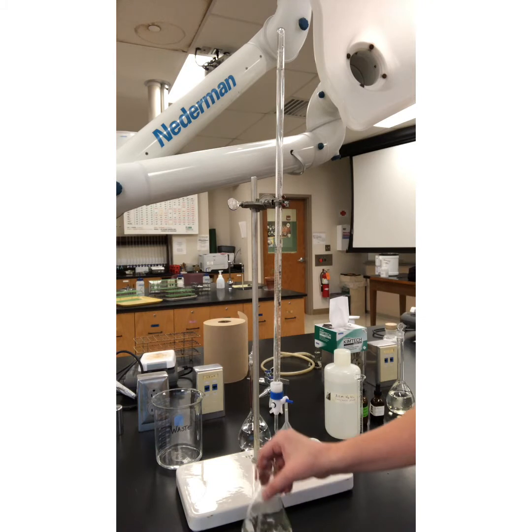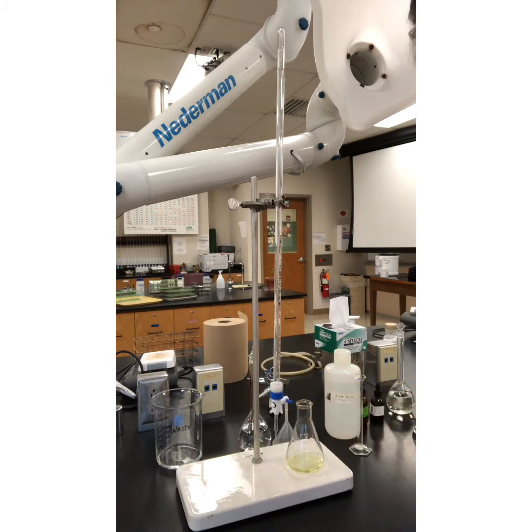Now I'm going to add my indicator, so you can see it when I put it right there. And 4 drops of my diphenylamine indicator. So 1, 2, 3, and 4. Okay. Solution 1 ready to go. Swirl it all up. We're going to do a lot of swirling in this lab.